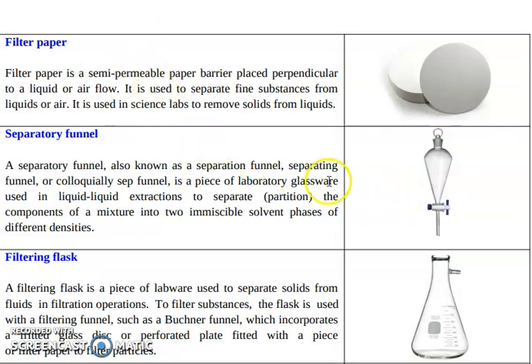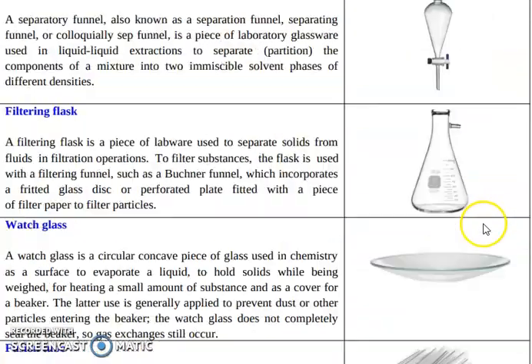Now, separating funnel. A separating funnel, also known as a separation funnel, is a piece of laboratory glassware used in liquid-liquid extraction to separate and partition the components of a mixture into two immiscible solvent phases of different densities.